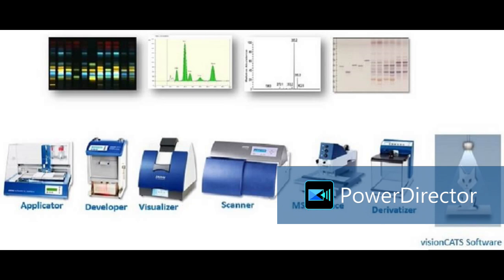Now this is visualizer. After sample application and separation of the components of mixture, how will separation happen? By capillary action the mobile phase will move up to the marked position, and it will separate the components as per the affinity of component towards stationary phase or mobile phase. Okay.